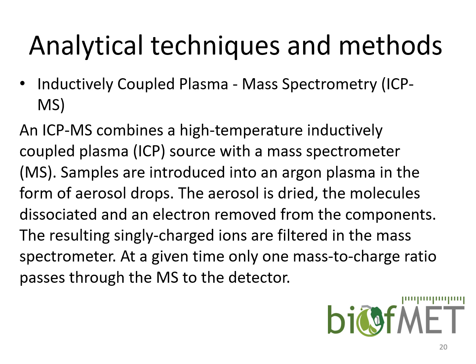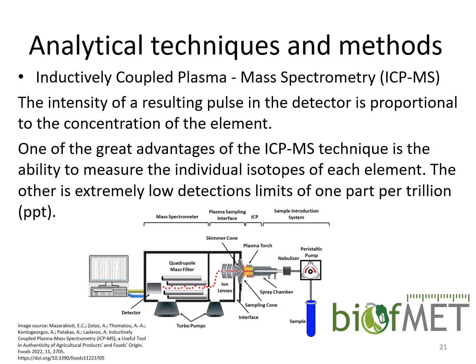These ions, their mass to charge ratio are a fingerprint, or they are very particular for certain elements. So that is how you can use this technique. It is very powerful in terms of identification of the elements present, and also from the intensity of the signal you can recover the concentration of the element. This type of instrumentation is very, very powerful. It actually gives you the opportunity to detect even PPT level.